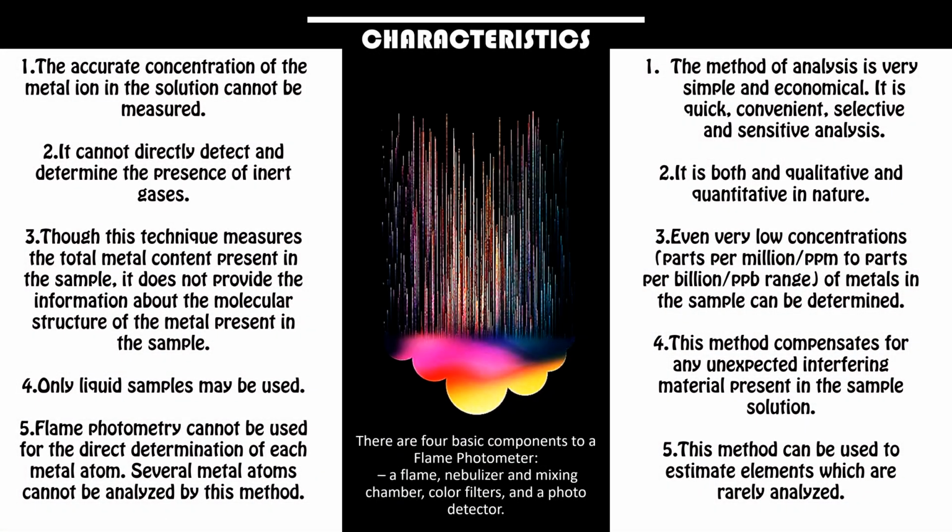Yay, we are at our last objective, the characteristics. Now always remember that there are four basic components to a flame photometer: a flame, nebulizer and mixing chamber, color filters, and a photodetector.